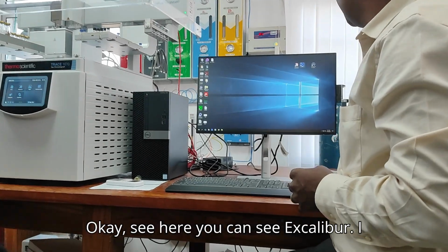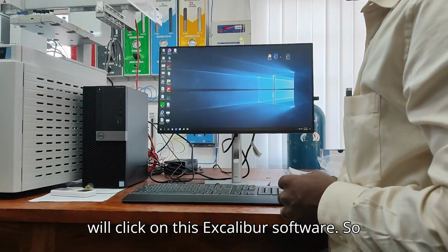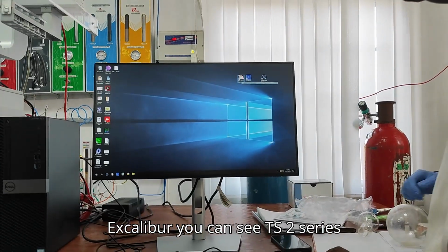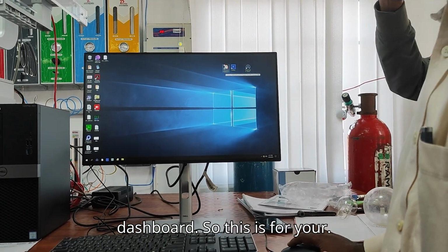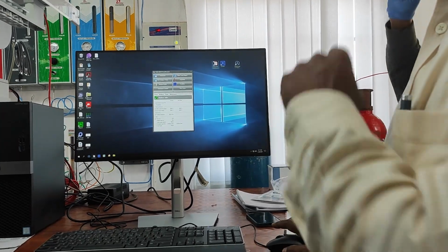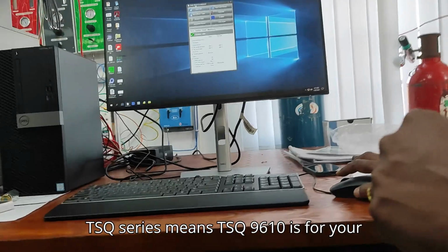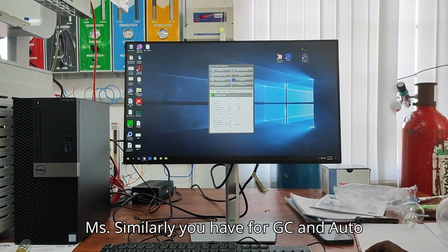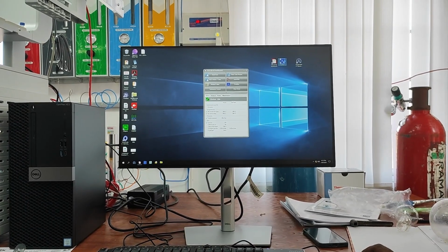Okay, see here you can see Excalibur. I'll click on this Excalibur software. So this is our software. Before going to Excalibur, you can see the TSQ series dashboard. This is for your MS operation, MS data. TSQ series means TSQ 9610 is for your MS. Similarly, you have one for GC and auto sampler.